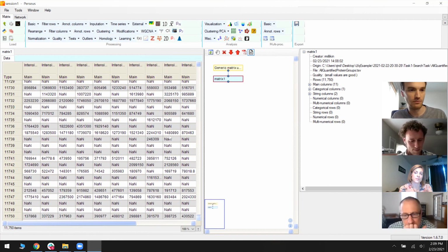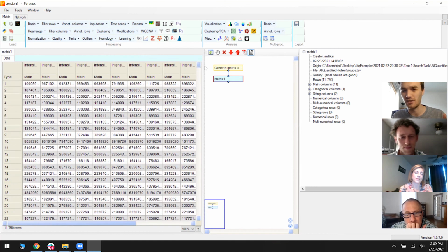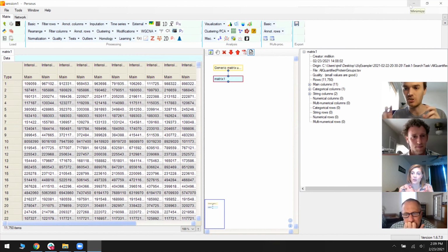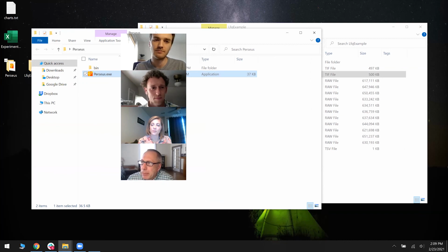And I can go through that if you want. It takes a couple minutes, but it's not too bad. And then with this data set, at an FDR of like 5%, I think there's maybe 8% or so that are significantly changing that are human, so they're incorrectly changing. But the FDR control is pretty good for t-tests and stuff. It's not amazing, but it's not bad. So that's kind of like the basics of quant.